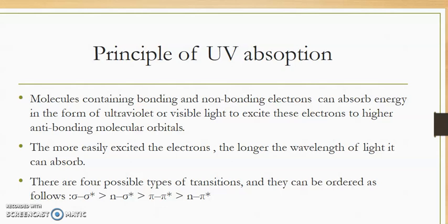The more easily excited the electrons, the longer the wavelength of light that they can absorb.